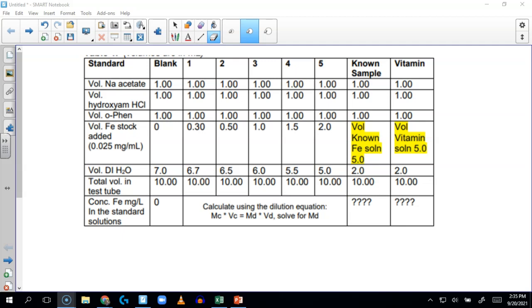Hey everybody, let me spend a little bit of time talking about how to go about doing some of the calculations for experiment 22 in Chem 118. Remember that in the lab you should have had 8 samples in the spectrophotometer. And here's the data on all 8 of those samples right here. And we are only concerned with the samples for the calibration curve 1, 2, 3, 4, and 5.